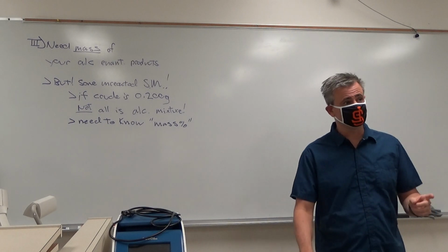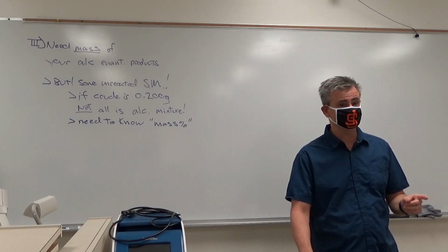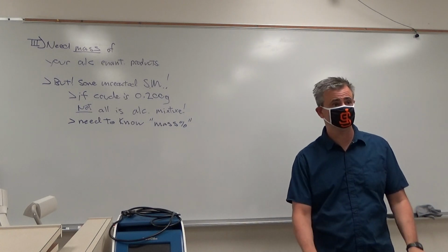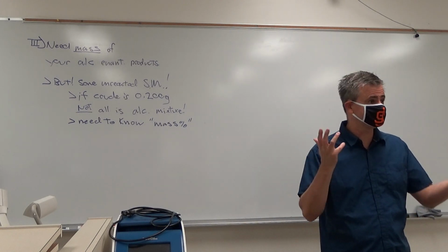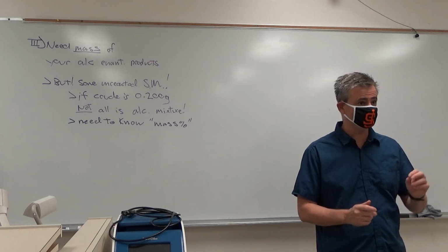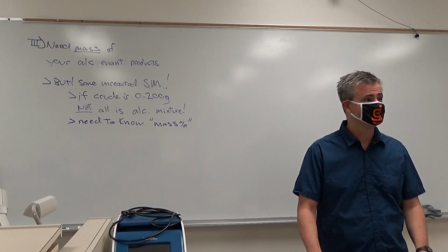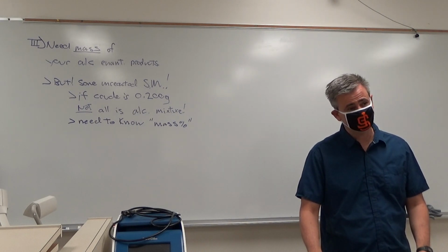They don't give you the mass percent directly. What they give you is the mole percent. They give you the equivalents, okay? Because they're different molecular weights. All right? NMR is a function of how many molecules are in the solution, not a function of how much mass is in the solution. Does that make sense? Okay?